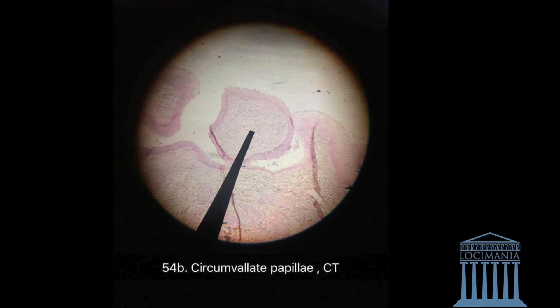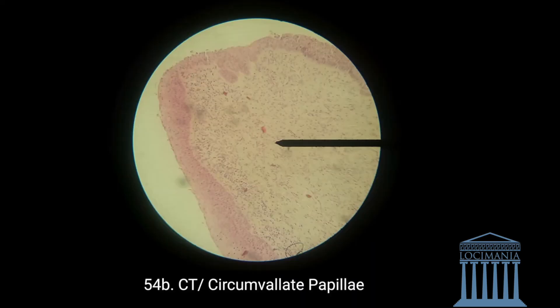Here we have a good look of the circumvallate papillae. Within it we have the connective tissue. It looks really good — maybe like a strawberry, I think. Sometimes you can also get a broad or flattened circumvallate papillae and it looks like this. Here we have the circumvallate papillae that is more broad. You can't see the strawberry form that much, but you can see the connective tissue inside and the secondary circumvallate papillae.